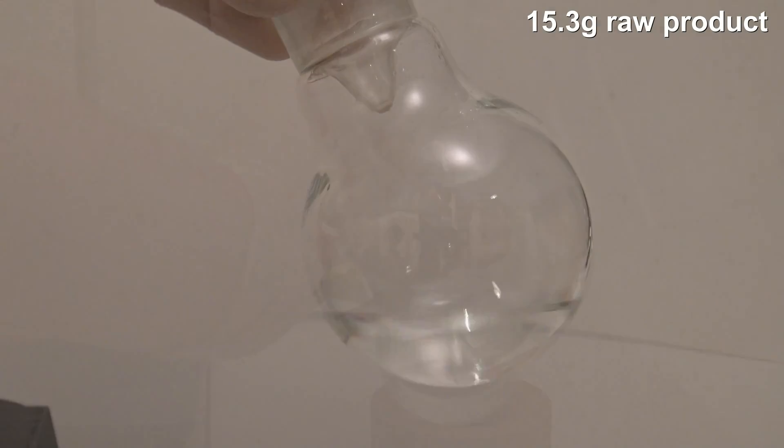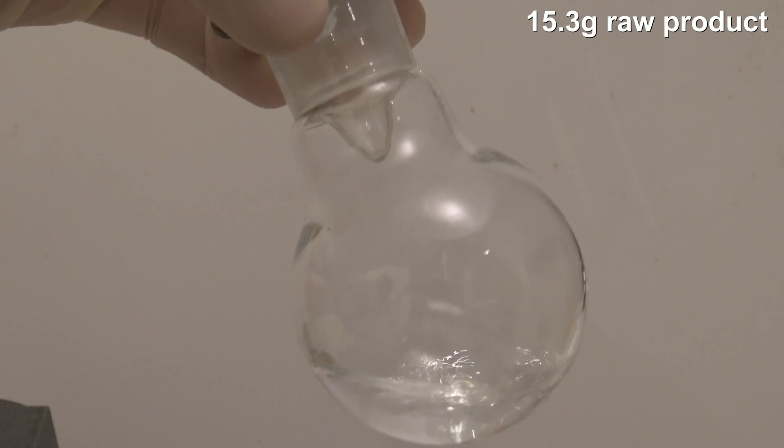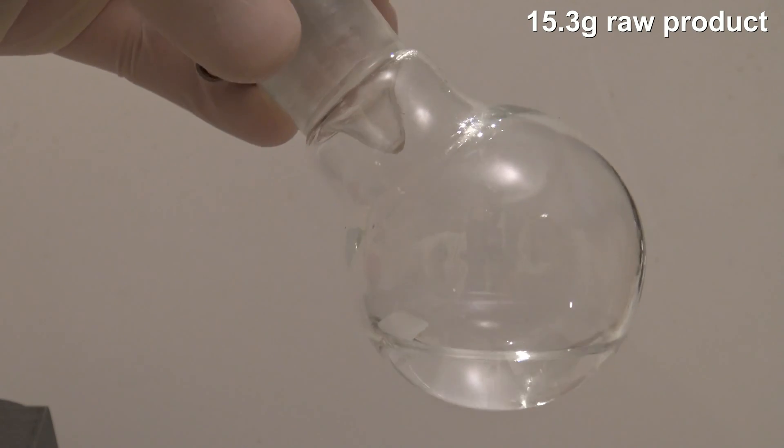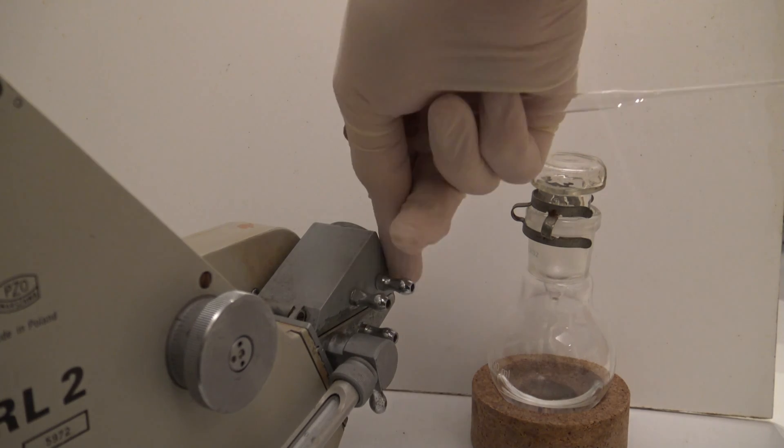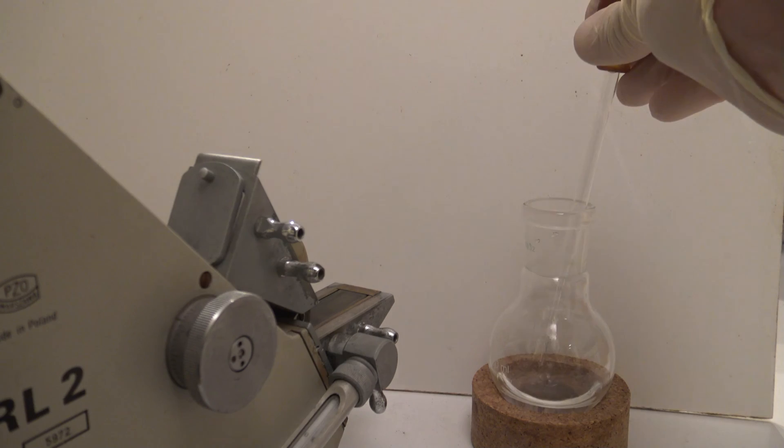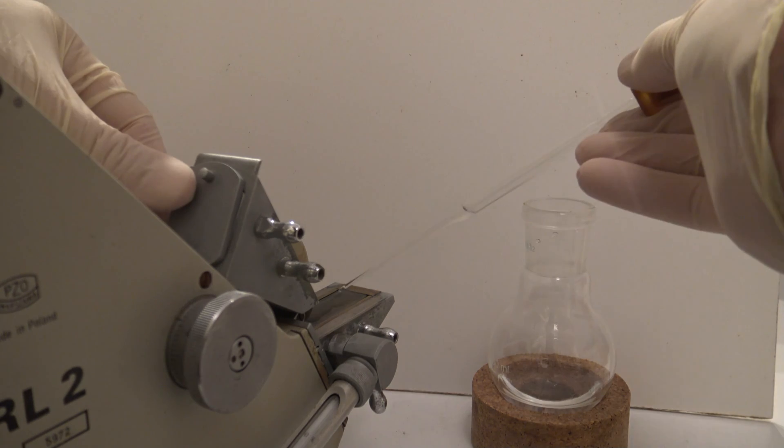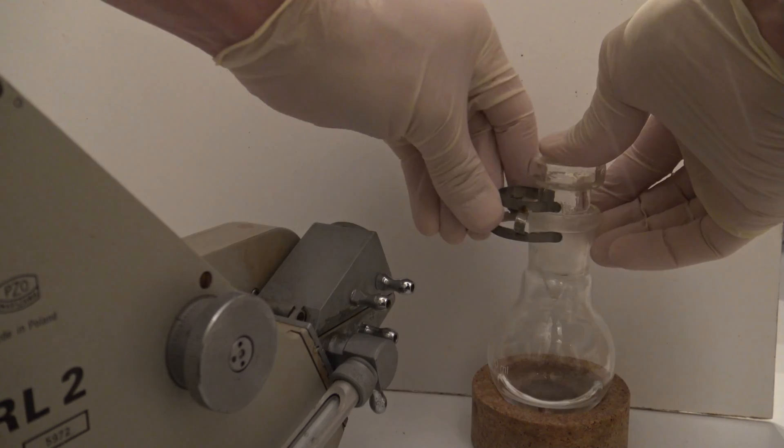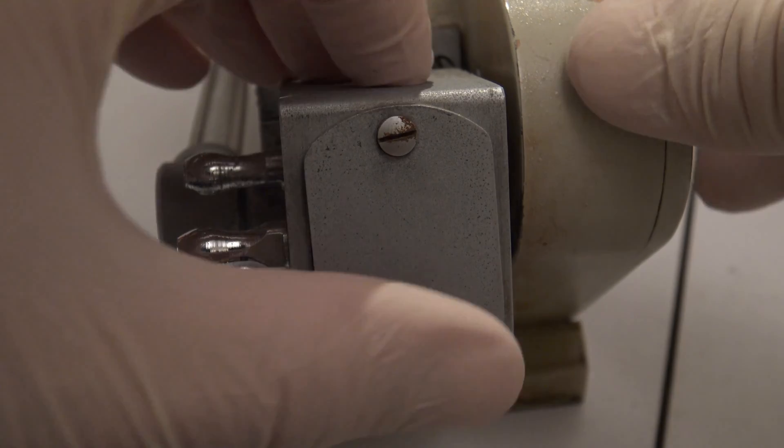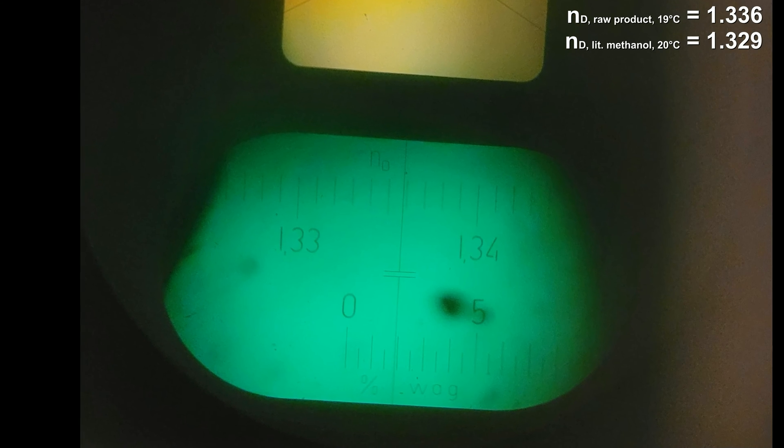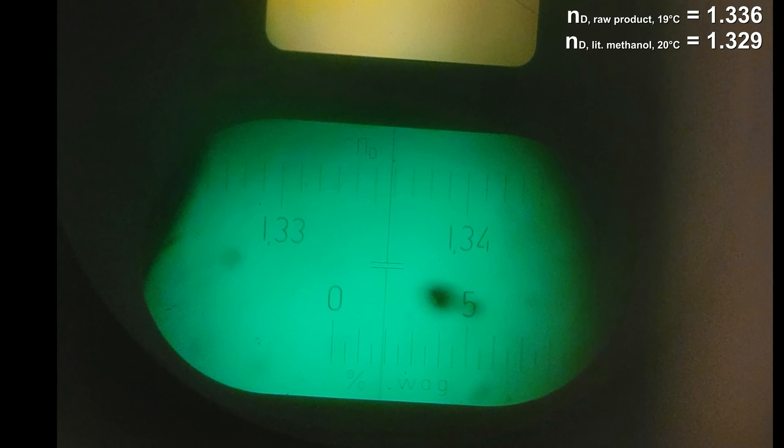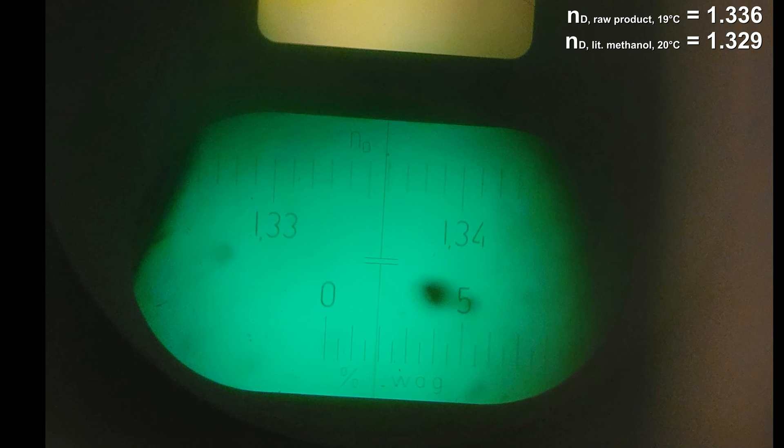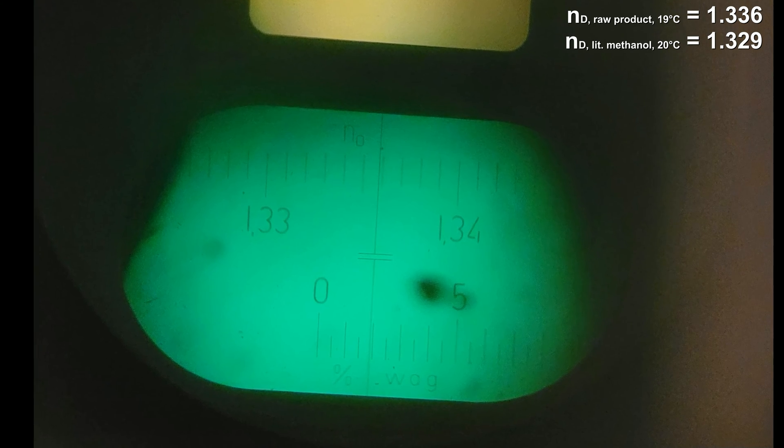15.3 grams of raw product were obtained, and after that the refractive index was determined with a refractometer. The refractive index was at 1.336, which was already close to the literature value of methanol. It has to be considered that the value should be around 0.002 higher due to the temperature of 19 degrees C in the lab.